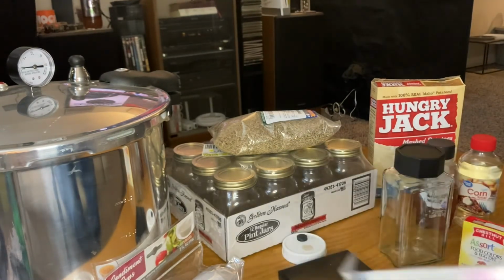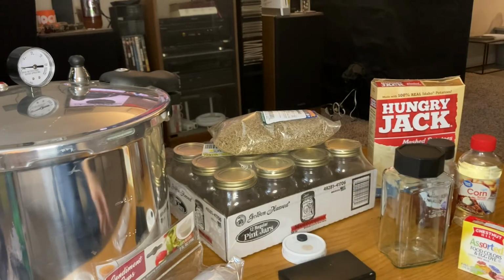And you guys will see that whole setup so that you can know how to do it when you want to do it. And you can do this with just about any kind of mushroom that's out there. So it's a very simple process. Everything is actually fairly inexpensive, a lot more inexpensive than buying from a lot of these companies that are selling the kits and stuff. And it's all a very simple process, just gotta be very clean.